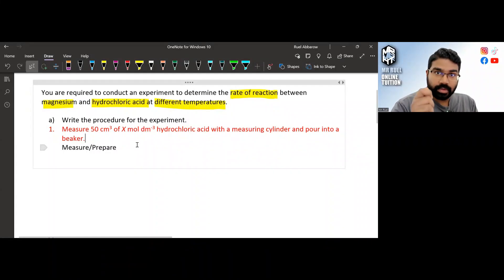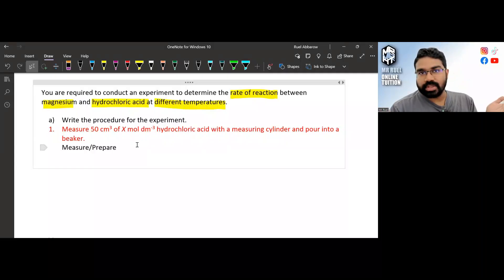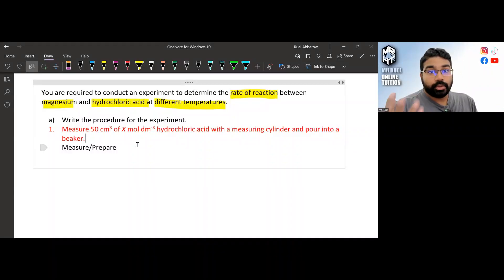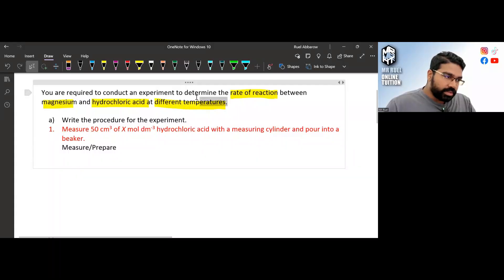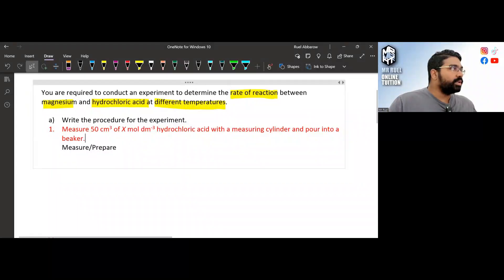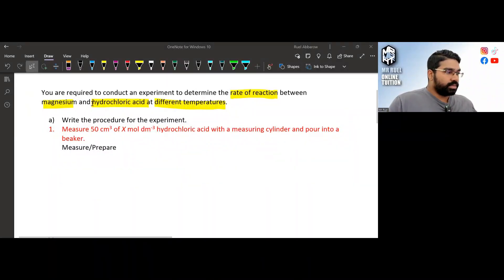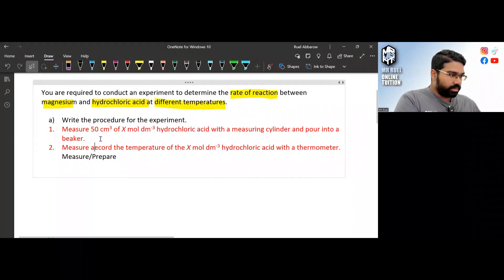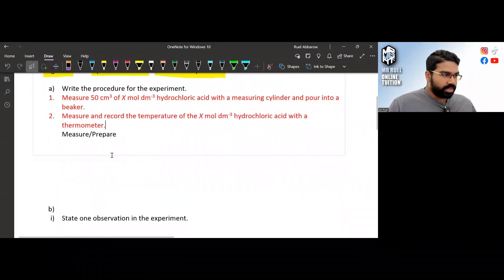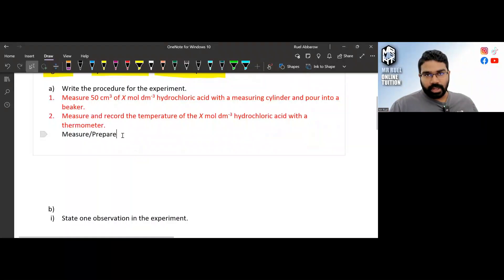We are also going to use a magnesium strip — nothing else to measure for that. Now for 'prepare': since we are using different temperatures, the first temperature is room temperature. So you need to measure and record the temperature of the hydrochloric acid using a thermometer. Measure and prepare — done.